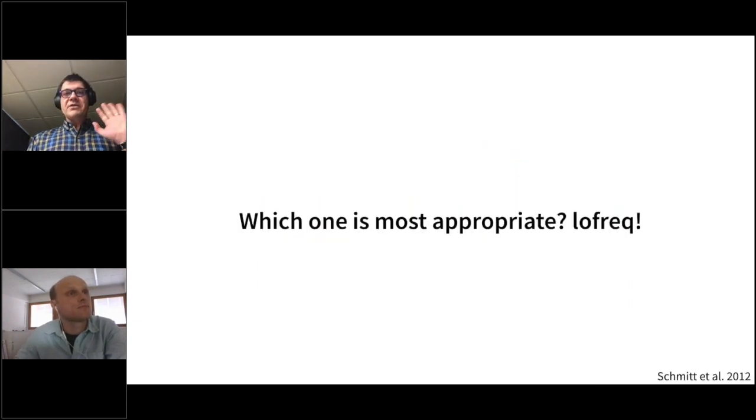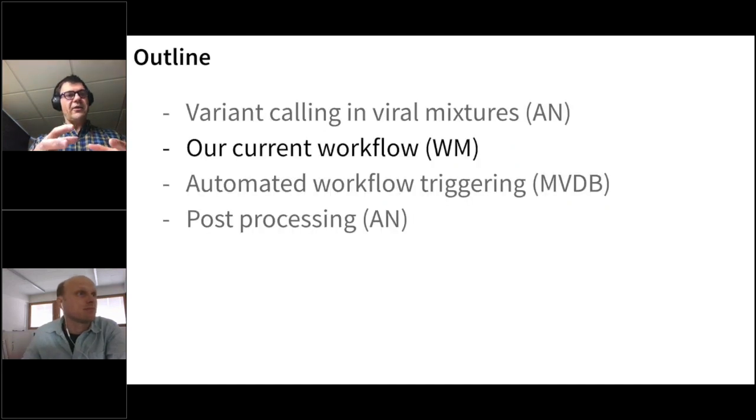Okay, so the bottom line so far is that we are doing calling on individual data sets, resequencing from a particular individual, and we are using lowfreq. And we came up with a workflow which Wolfgang is now going to show. And I need to stop sharing for that. You can continue sharing it and just switch to the next slide, and I can take over.